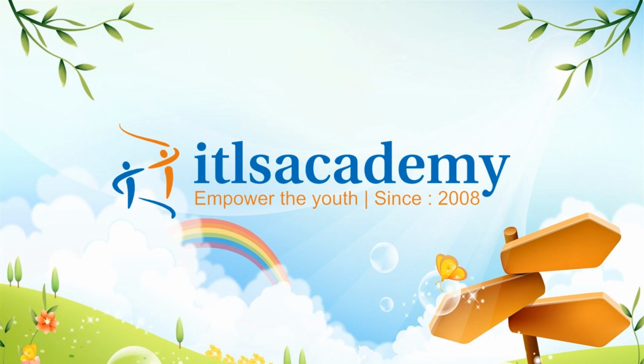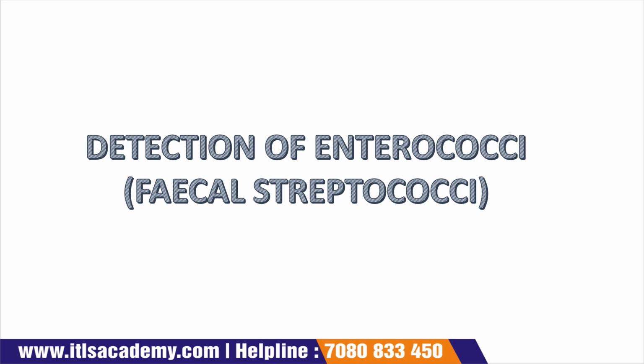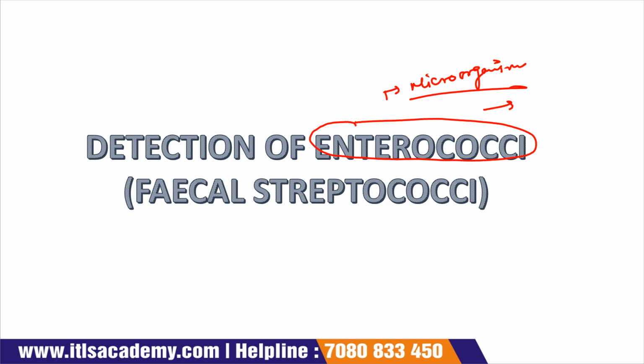Today we are going to discuss the topic of detection of the enterococci, fecal streptococci. So why do we detect this enterococci? We all know that it is a microorganism, and if it is present in a water sample, then the quality of the water decreases.